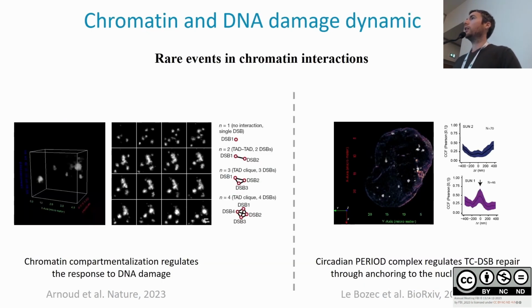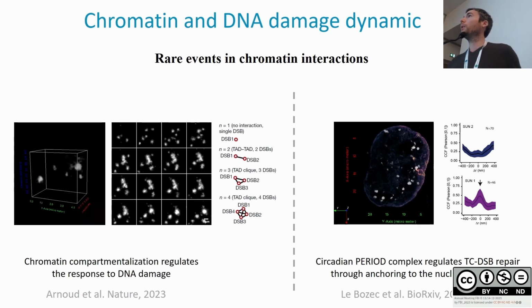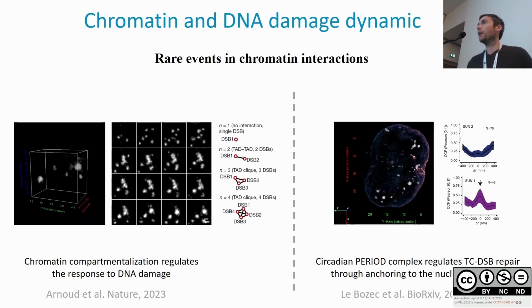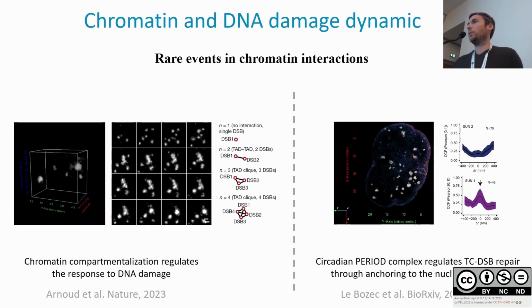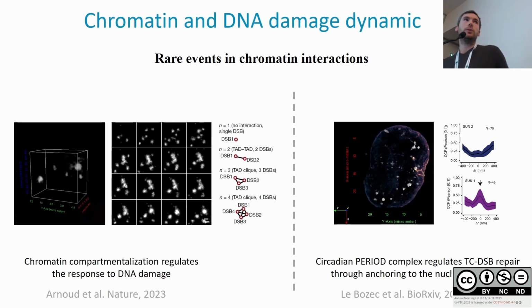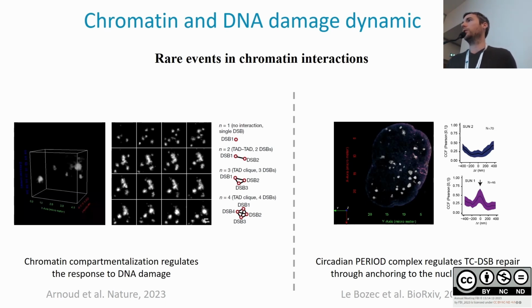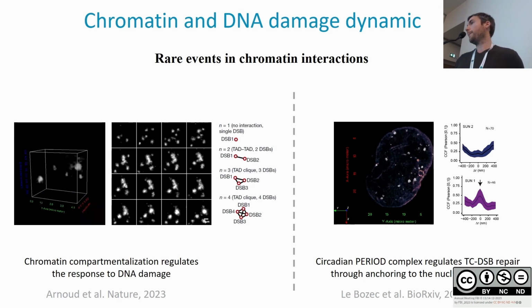Okay, and finally, an example with a study of chromatin interactions, DNA damage repair, where there's a paper published by Gaëlle Legube's team in Nature with a lot of RIM images, where they discovered a new compartment on the chromatin.